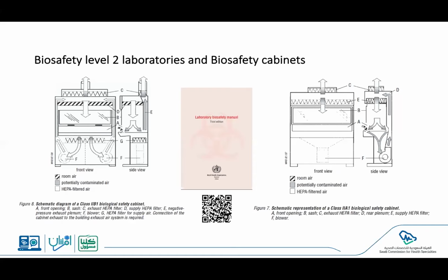And those cabinets are quite different from each other. Mainly, A1 and A2 are to be utilized for any biological agents, while B2 is mandatory for handling chemicals with fume. However, this can vary.